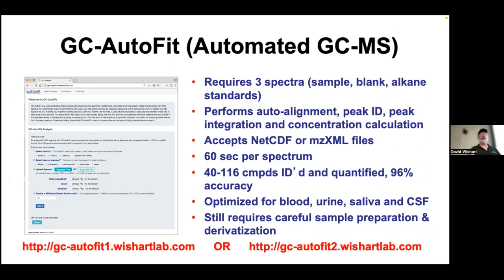Same thing with GC AutoFit — there are two servers, either GC AutoFit 1 or GC AutoFit 2. Make sure you know which one you've been assigned to based on what's shown in the slides.